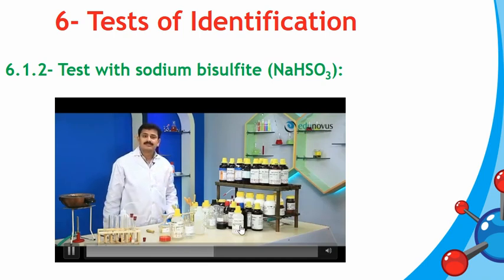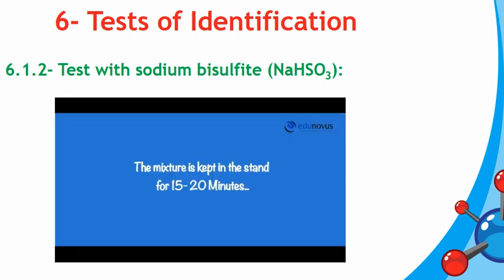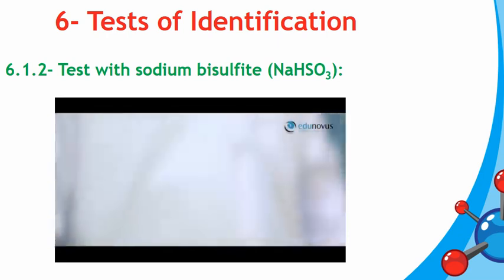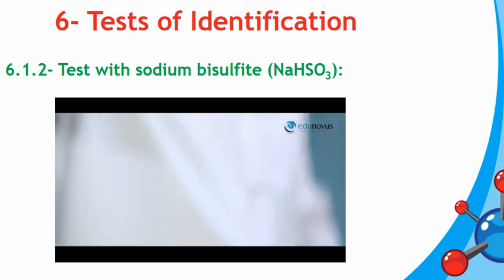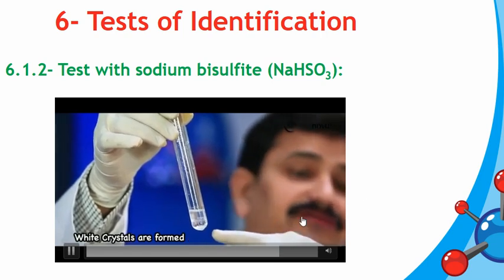After 15 to 20 minutes, these are the white crystals formed.